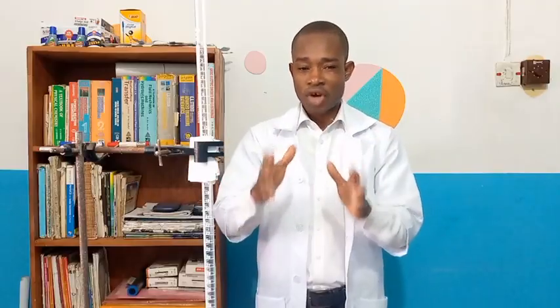Now, like I mentioned, this is going to be a redox titration experiment. I'm sorry, I'm not going to display the experiment in this video lesson. Subsequently, I'm going to carry you through how to carry out the experiment, with the solutions shown to you. But specifically, the focus of this video lesson will be on how to carry out analysis and calculations on these solutions during redox titration.